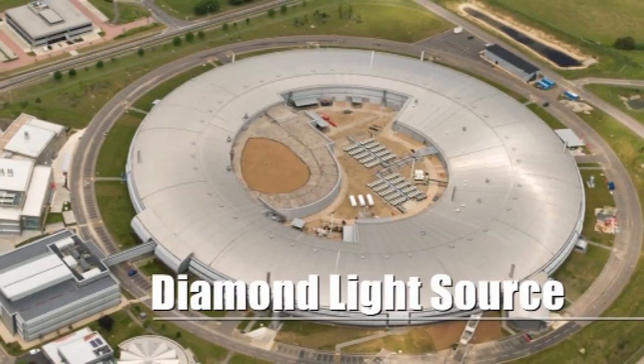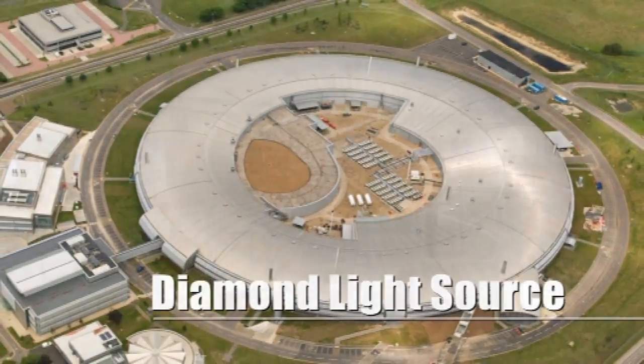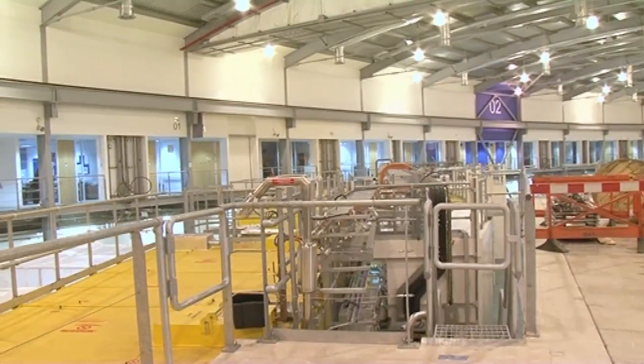We're about to walk round the Diamond synchrotron storage ring roof, so we'll get a bird's eye view of all of the beamlines as we go round.